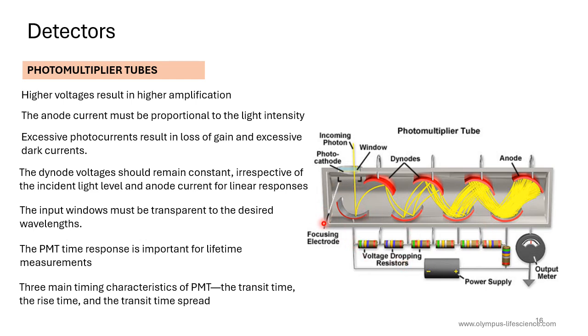So it starts from a high negative voltage and then it ends at nearly a zero voltage.